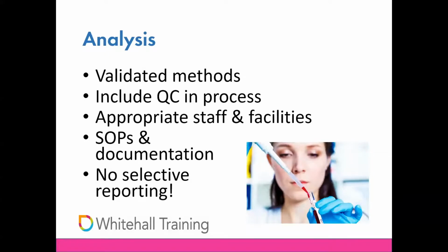So any analysis that's taking part or evaluation work needs to use appropriately validated methods. The only exception is where one of the objectives of the clinical trial is actually evaluating the analysis method that you're using. But by and large, any analysis needs to use a validated method. The primary objective of validation is to ensure that the method is going to be robust, reliable, and reproducible. So in other words, not dependent on one technician who's able to make it work or needing to be routinely run 3 times before the results look acceptable.